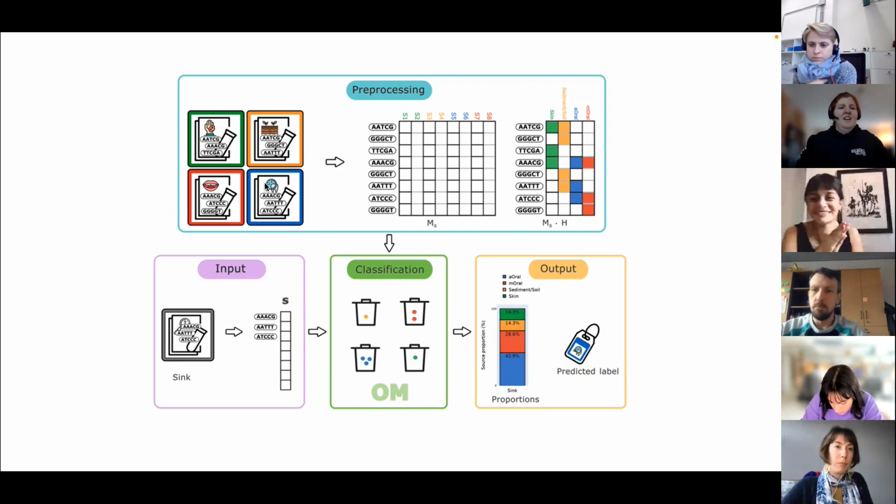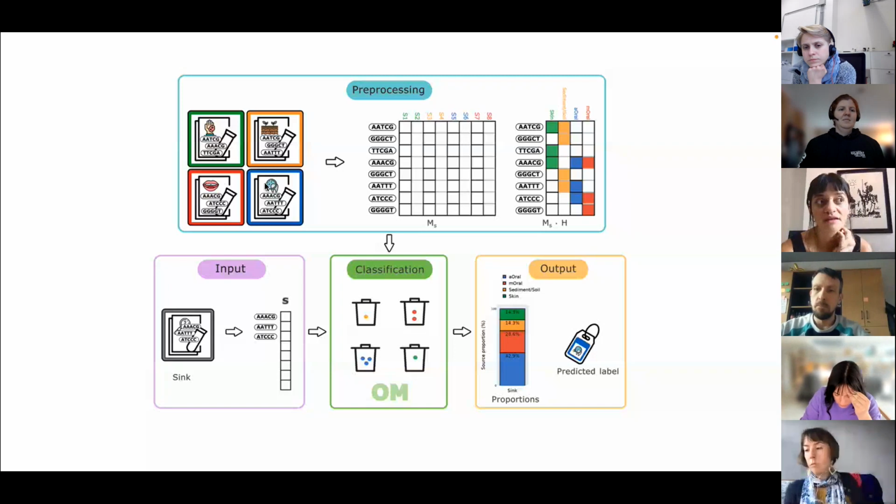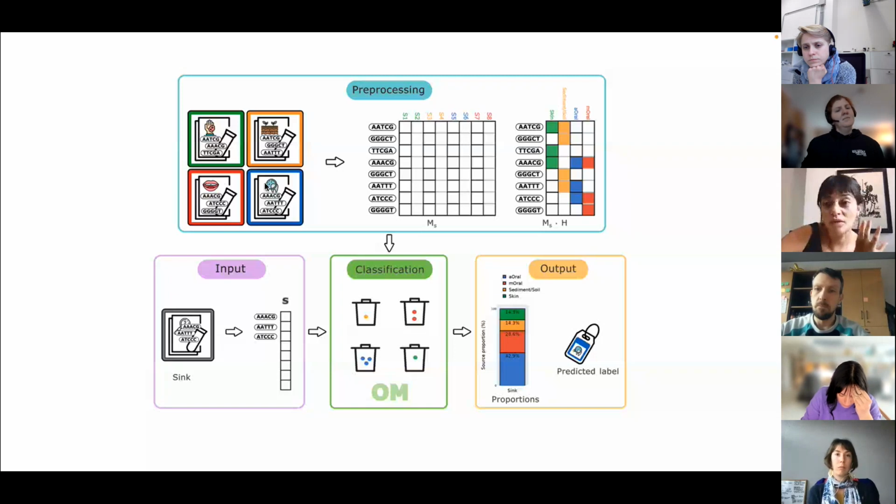I thought I wasn't super clear. Yes, exactly. You can do that with your own source environments, with your own research question, and then extract those k-mers from the matrix. If you already know the ones that you're interested in, then use that as an input to k-mer broom. Exactly, that's what we did.